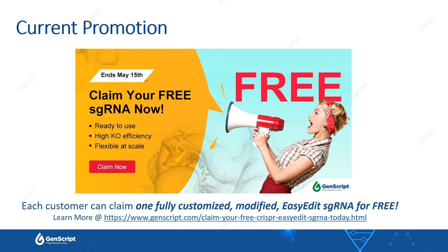Another one, how to deliver RNP in vivo? So we do have a default transfection sort of guideline available online. So it should be no different than any other system.